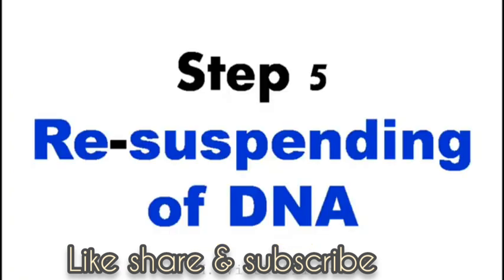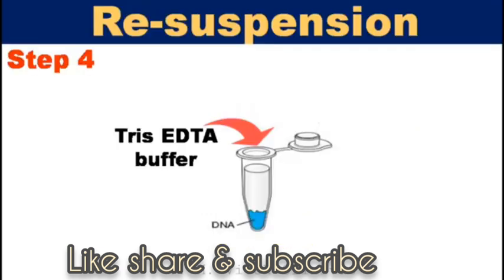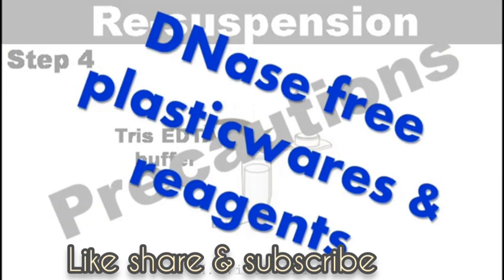Last step. Resuspending of nucleic acid with a buffer. In this, the washed, precipitated, air-dried nucleic acid is resuspended in TE buffer, for storage purpose, until further use. Precautions to be taken. DNase-free plasticwares and reagents should be used.